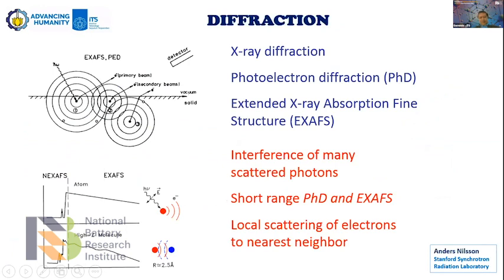This is the more common apparatus, especially in our country. Many have the XRD apparatus, but photoelectron spectroscopy, EXAFS and so on are very rare. And as far as I can remember, at the neutron facility in BATAN there are four experimental setups, including small angle neutron scattering, HRPD, high resolution powder diffractometer, triple axis spectrometer, and the last one is a neutron reflectometer. Sorry, I forget.